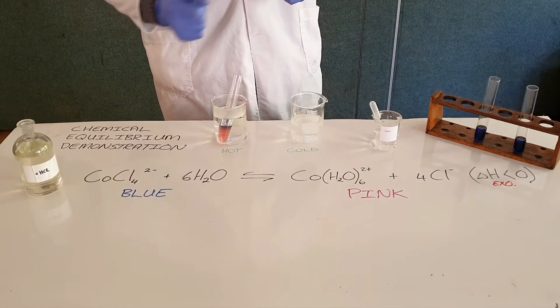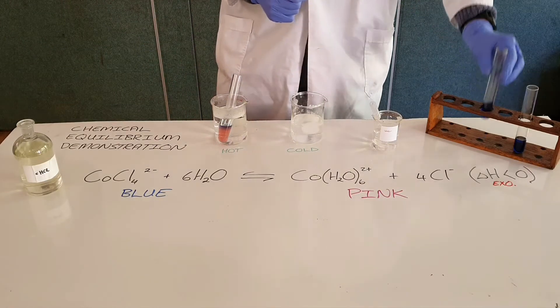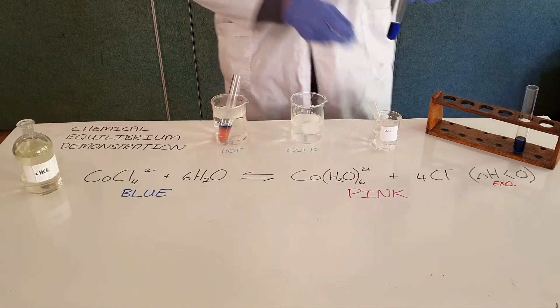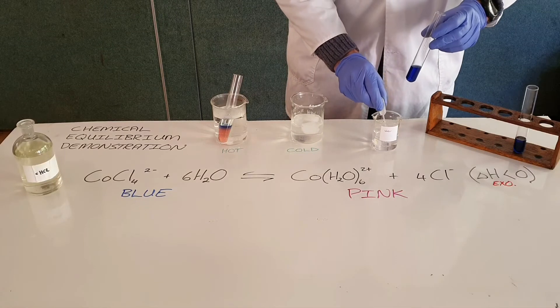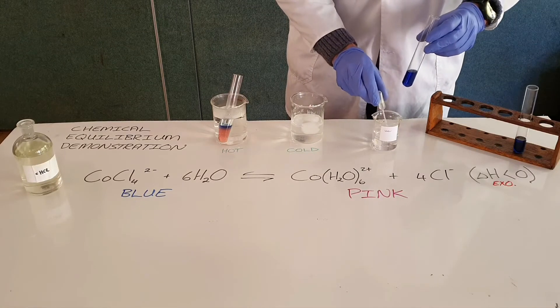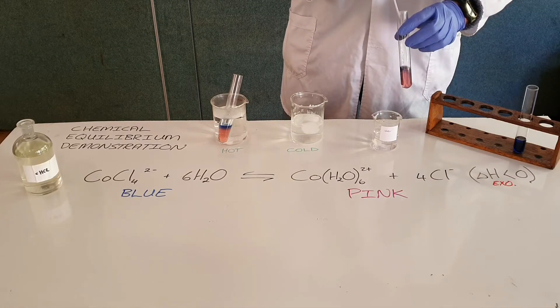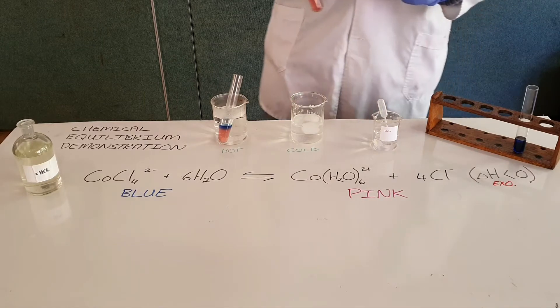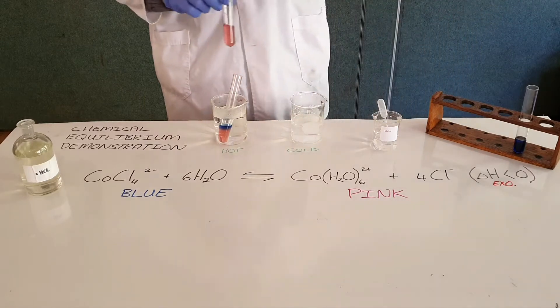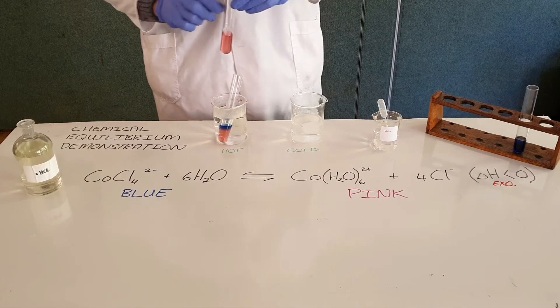While that proceeds, I'm going to demonstrate the common ion effect with another reaction. Once again, we start with our cobalt chloride, add water to that solution, and once again we form a mixture that is at equilibrium.